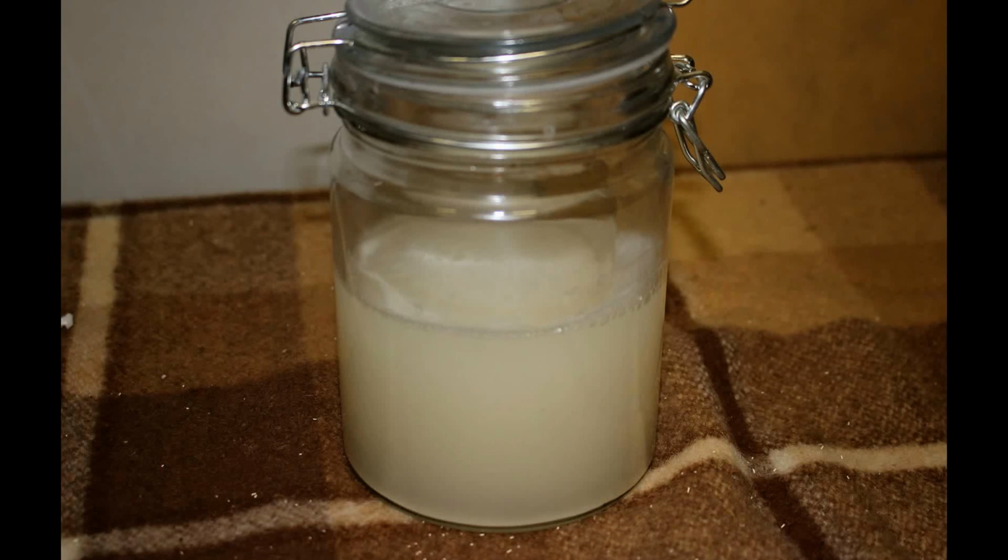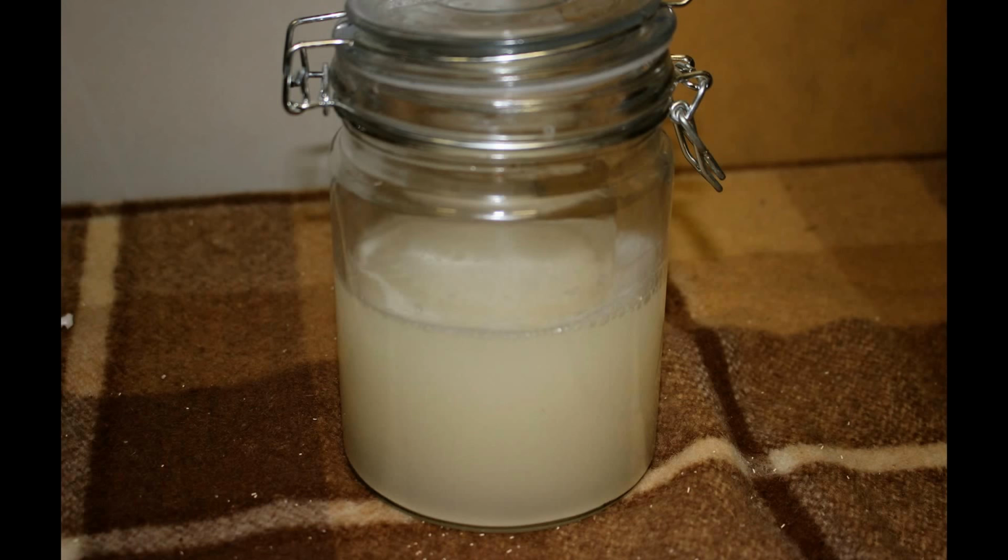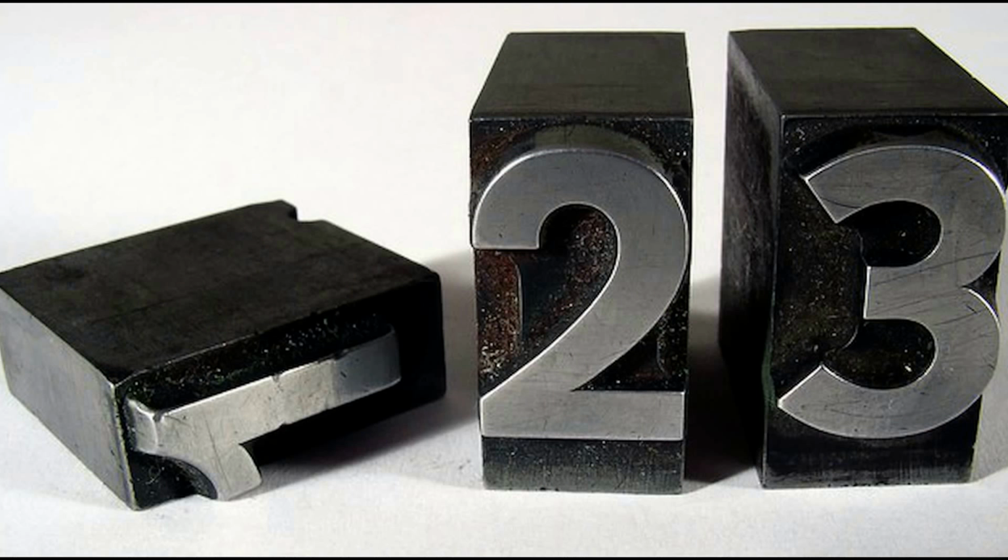This video will show you how to make a liquid culture of the Saflager S-23 yeast for fermenting in cold weather. It will produce up to 2 liters of yeast culture over 48 to 72 hours. It is scalable up to a point and adaptable to most any other species of yeast you choose to use. The process itself is reasonably simple.